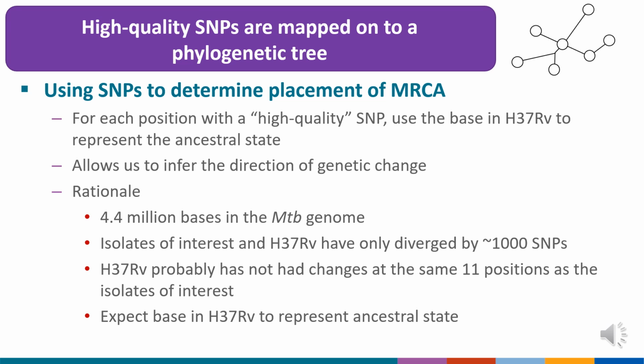Here we're going to go through each position with a high-quality SNP that differentiates the isolates in the comparison and use the base in H37Rv to represent the ancestral state. This allows us to infer the direction of genetic change at each of these positions.